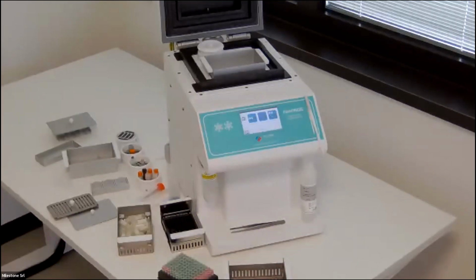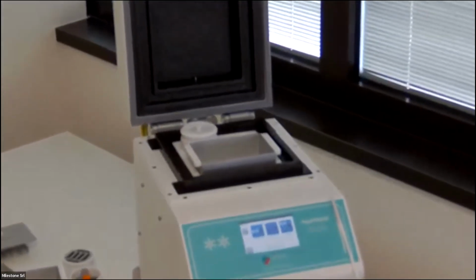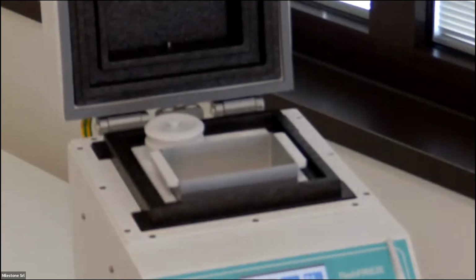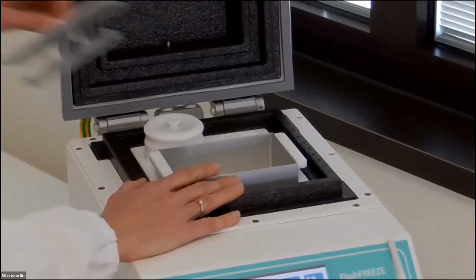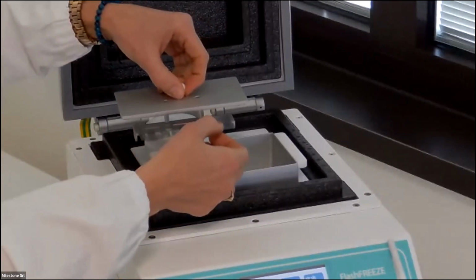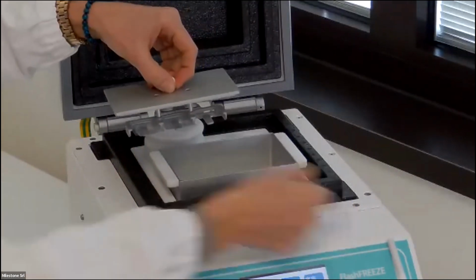Okay, let's move on to another question. Which type of cryomold can be used? And can I use the round cryomold in the flash freeze device? Yes, surely. Basically, all the Sakura cryomolds can be used in our system because, as you can see here, for example, I put one biopsy cryomold, so very small.